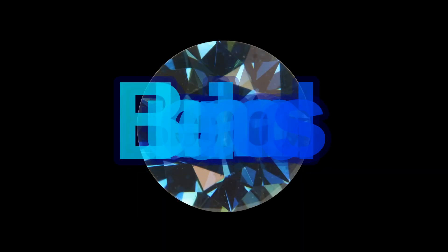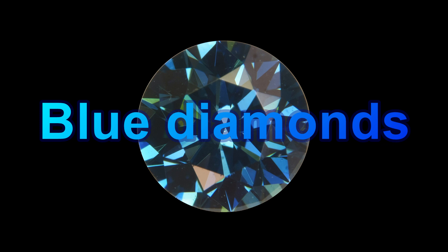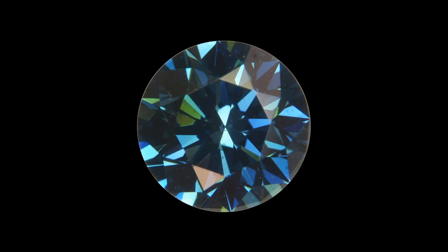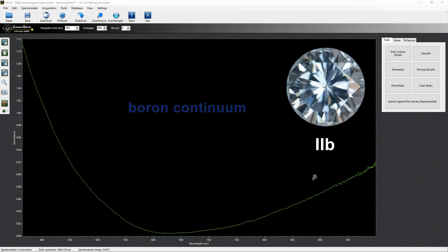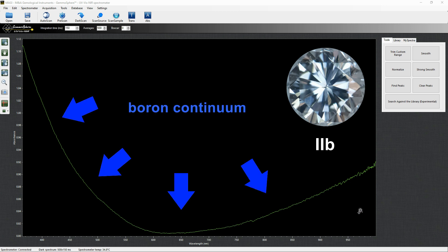Blue diamonds. Natural blue diamonds are type IIb and embed substitutional boron in the crystal lattice. Their UV-Visnir spectra display a slow boron continuum.